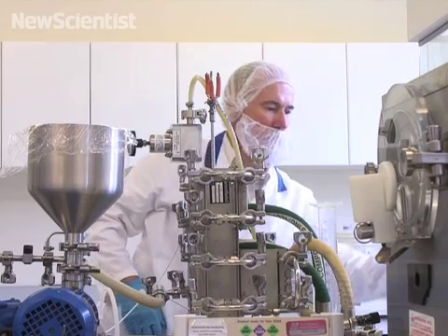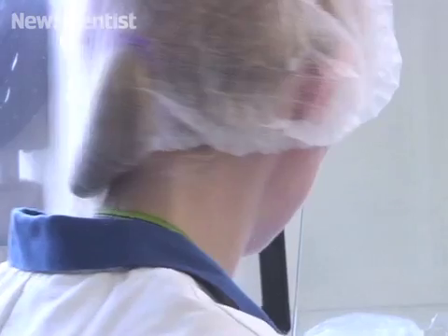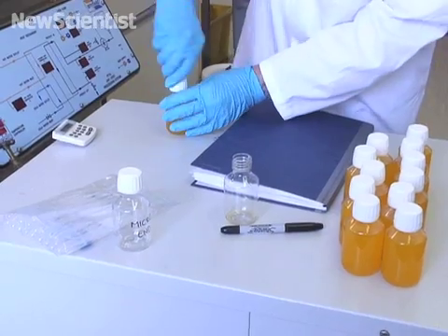This is ready to go into the pasteurizer now. The drink is pasteurized by heating it at 75 degrees Celsius for 15 seconds. Afterwards, it's put into sterilized bottles using an enclosed hood to prevent contamination.